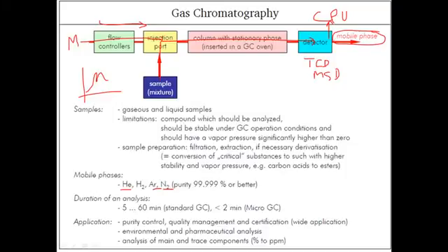And remember, each time we run a chromatography, after the run we have to clean this column, because we need a column which is free of any molecules from the previous experiments. That's why we need to have a clean column every time.